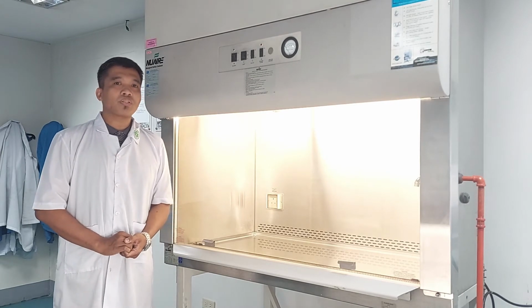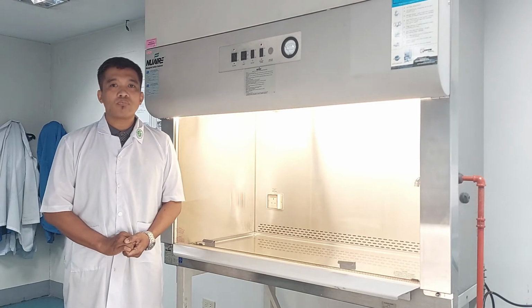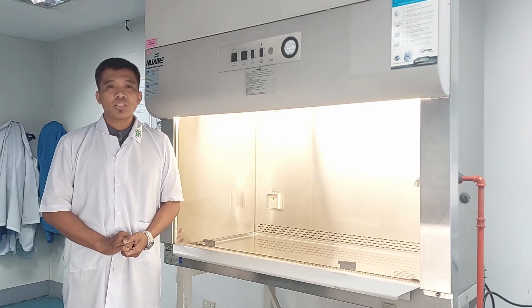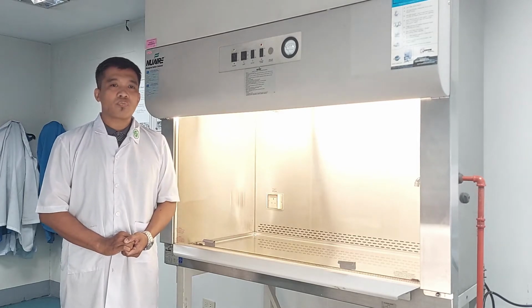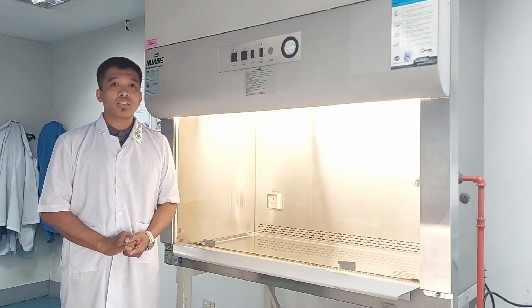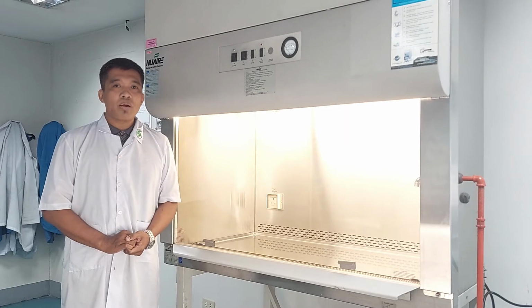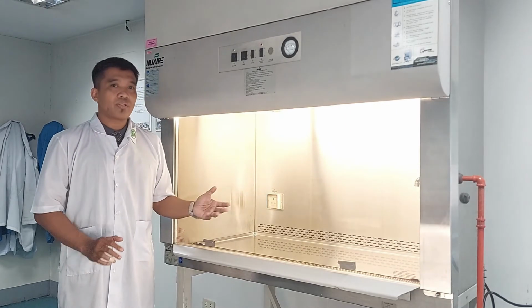The main purpose of containment is to control aerosols and vapors, but in a much broader sense, consideration of safety equipment should serve to effectively isolate the user from the hazardous material being processed. Protecting the material from personnel is also a concern in some instances. One of the primary ways to achieve this objective is with the Biological Safety Cabinet.